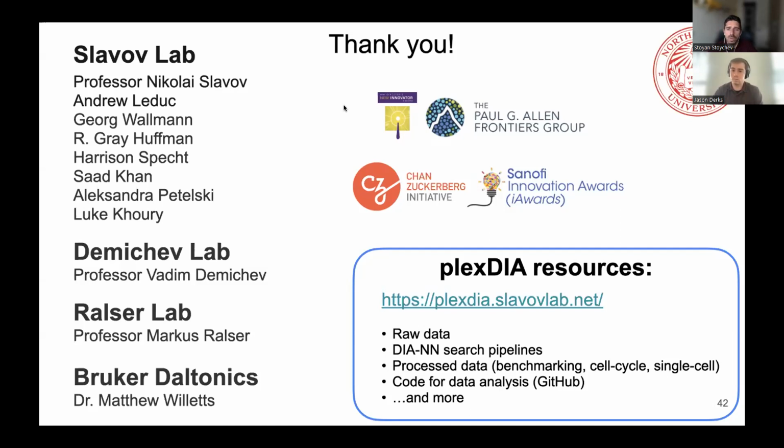Okay. Maybe a follow-on question from me would be, do you check for the labeling efficiency in any way, or do you just assume that it's, yeah, absolutely. Yeah, and thank you for asking that. I probably should have mentioned that. Yes, we absolutely check the labeling efficiency.